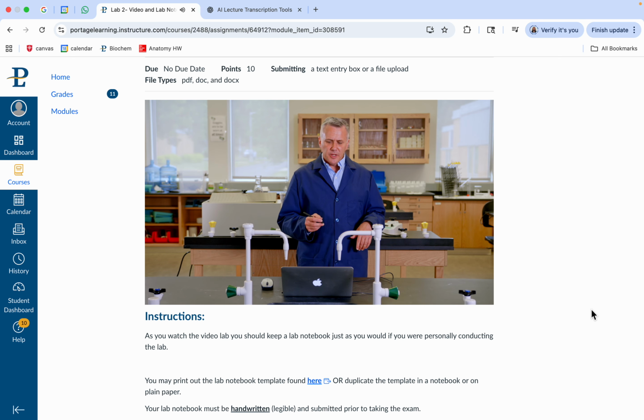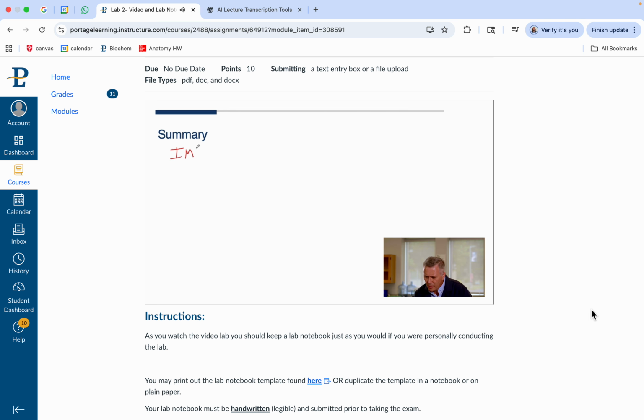All right, in this summary, a couple of things that we've looked at. We had two major parts of this experiment. One I'll label IMF, for intermolecular forces. We reviewed the general information for intermolecular forces: we have London forces, dipole-dipole forces, and hydrogen bonds. The London force is the weakest, dipole-dipole is in the middle, and hydrogen bonds are a special subset of dipole, so they're the strongest. We related those intermolecular forces to both viscosity and vapor pressure, and we've seen how intermolecular forces can impact both of those.